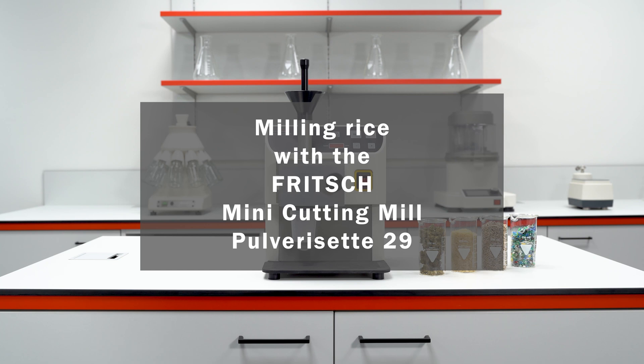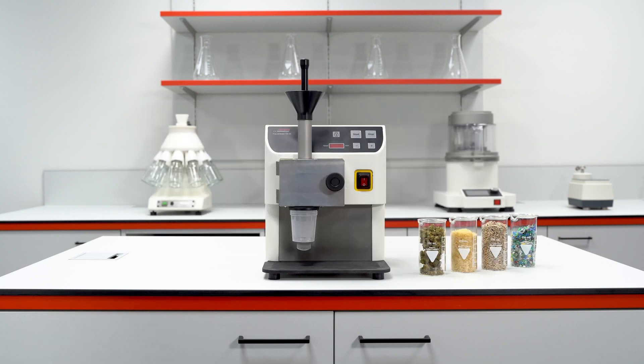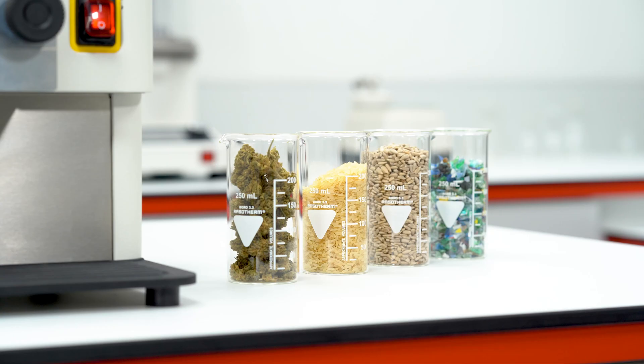The Strong and Compact Mini Cutting Mill Pulverizette 29 by Fritsch. In this application video, we will guide you through the process of milling rice with the P29.